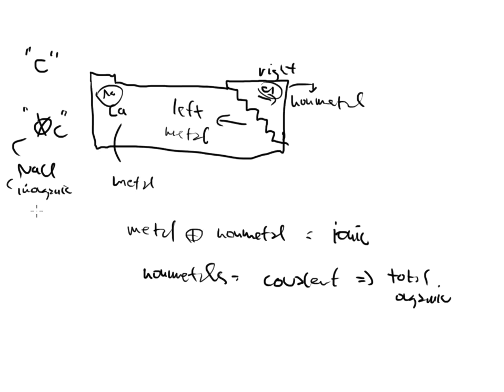That doesn't really even matter at this point because this compound does not have carbon. It has chlorine, but it doesn't have carbon. Therefore NaCl will not be measured in the total organic carbon analyzer. If it doesn't have carbon, you're typically not going to be able to see it in this machine.